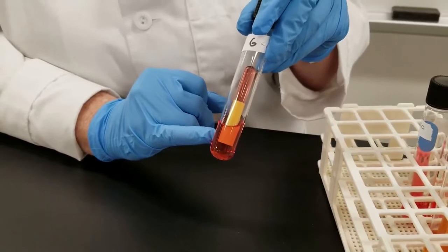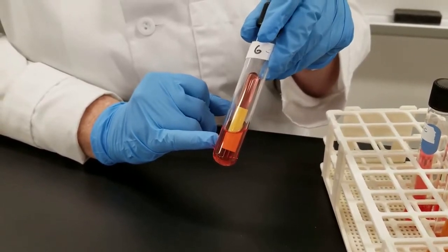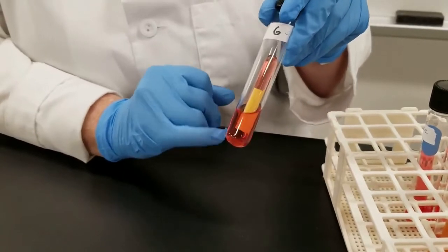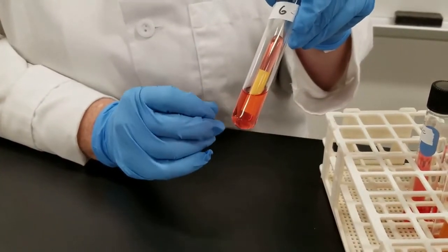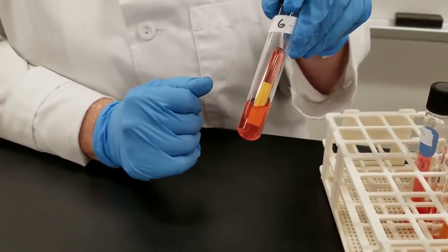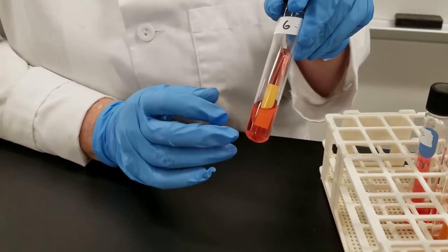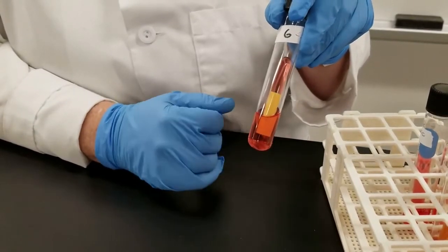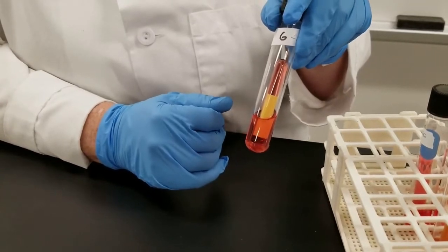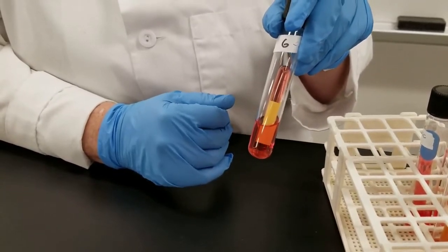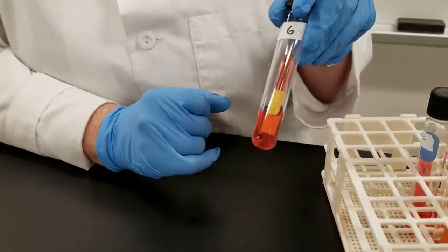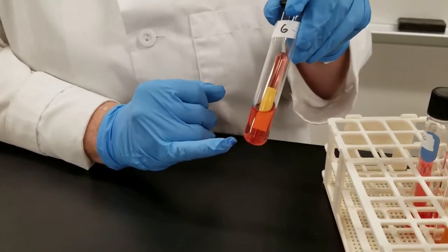This has the phenol red pH indicator added to it. So at neutral pH it has this kind of orangish red color. Some organisms as they break down the sugars, the byproduct is going to be acid and that's where the pH indicator plays a role. Visually we'll be able to look at it. When the pH drops to a more acidic or low pH it turns yellow. And so for some organisms when we come back and look at this after it's incubated, it will be yellow.